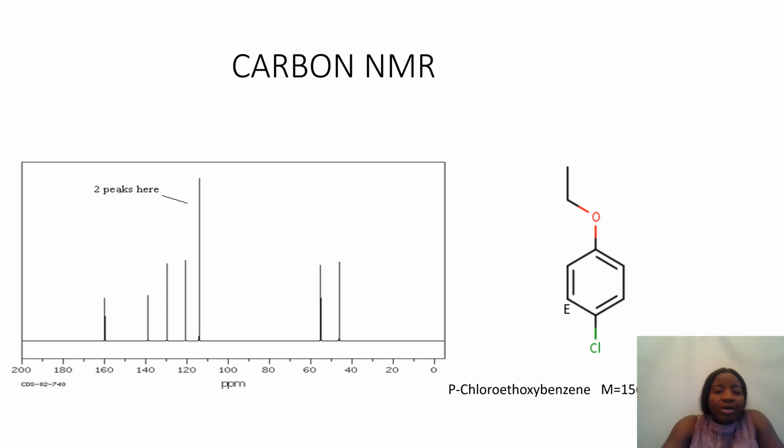Now, when I look at here, I realize some of the carbons are more downfield than others. These carbons are all the carbons that are on our benzene ring, and these 2 carbons are the CH2, CH3 we had, and we can see that they're also kind of deshielded because we were expecting them to be close to 0 right here, which confirms that I have electronegative elements on my molecule.